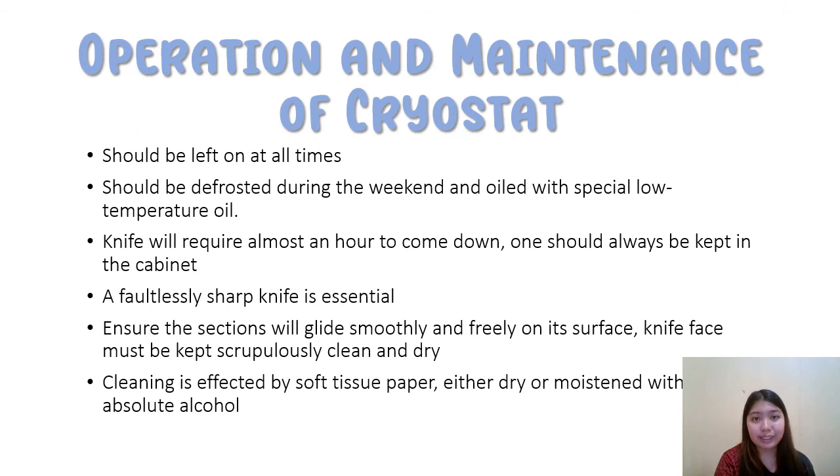Operation and maintenance of the cryostat. First, it should be left on at all times. Second, it should be defrosted during the weekend. The inside of it should be cleaned and dried, and the microtome should be cleaned and oiled using a special low temperature oil. The knife will require almost an hour to come down to operating temperature. That's why one should always be kept in the cabinet.